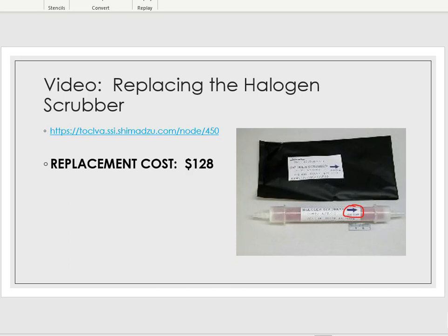Shimadzu's, those could be a little bit different as far as how they're made and the way the lines are fed. So that really is based on the instrument manufacturer. It's not really a universal direction like that arrow always needs to be pointed up. Not necessarily, okay? So that really is just based on what type of TOC instrument that you are using in your laboratory at that particular time.